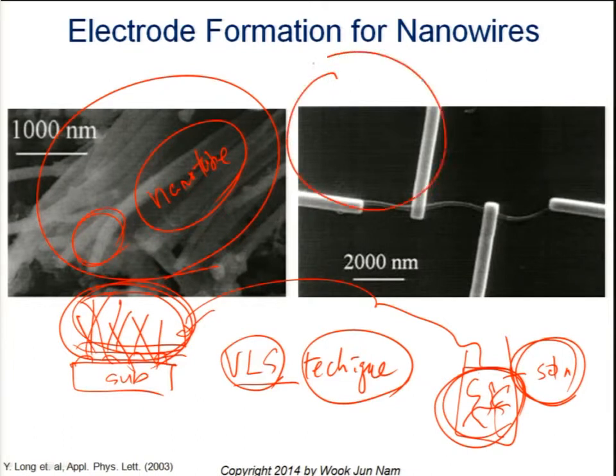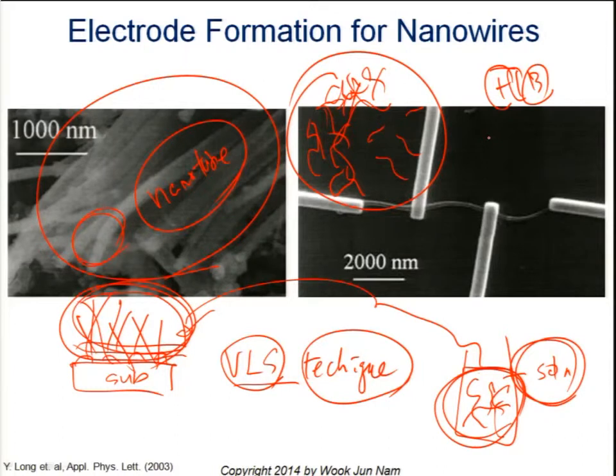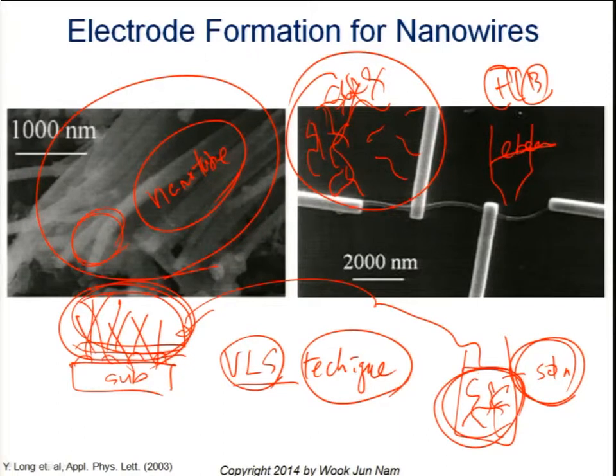If this is the substrate, in some areas the nanowires are all gathered together, and there will be areas where the nanowires are pretty isolated. Since we are using the focused ion beam, which has two columns, one is an electron beam column, which can be used as an SEM. So using this SEM mode, we can find this specific area, which is pretty isolated.